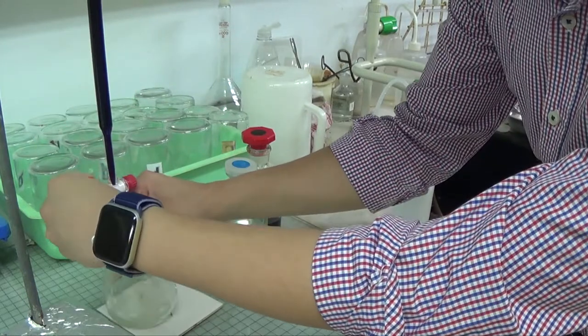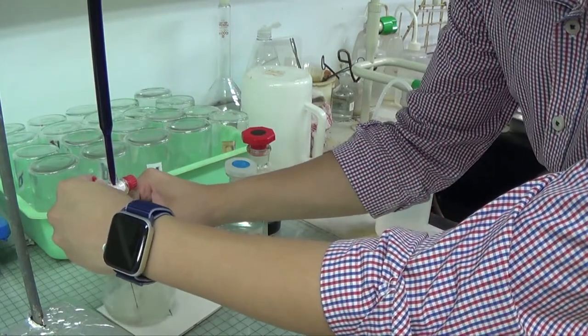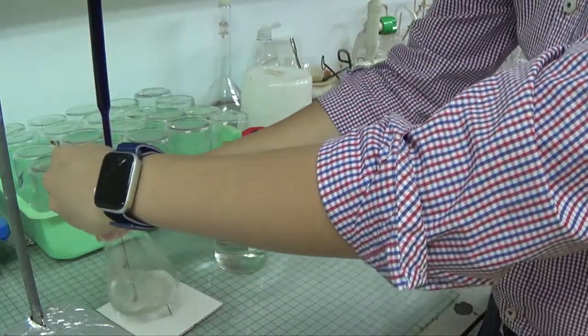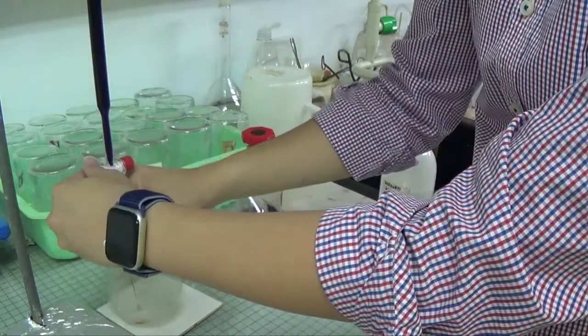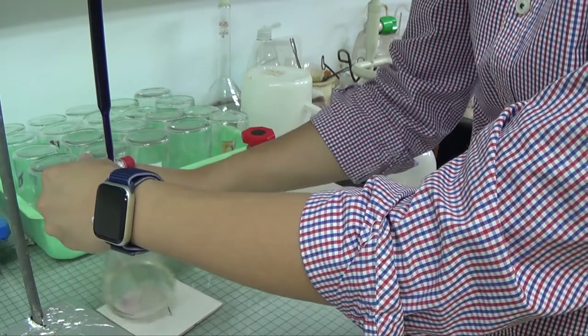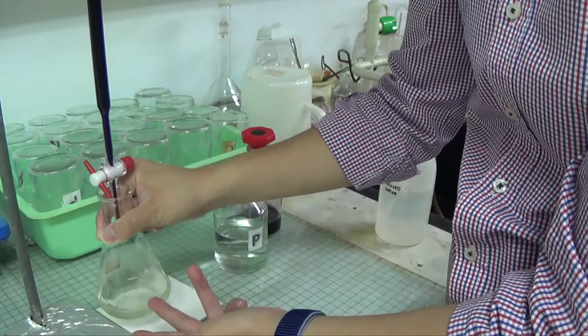Alright, I'm doing a rough titration. The first titration must be a rough titration, so I don't really care too much about accuracy for the first one. Alright, so I'm just letting it free flow. Okay, I just want to know roughly where it is, alright? So just now we started from 2.70. So I stopped swirling for a bit.